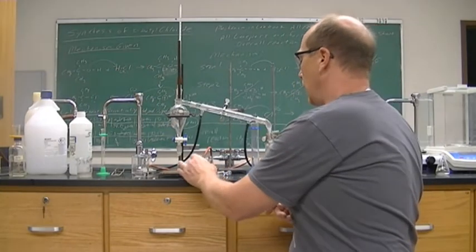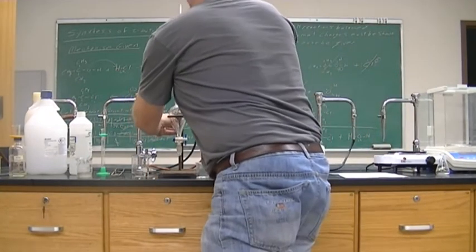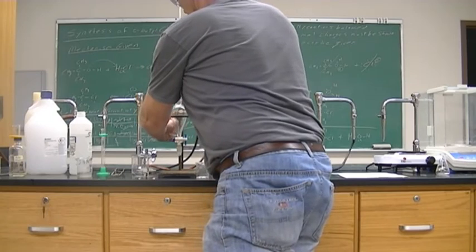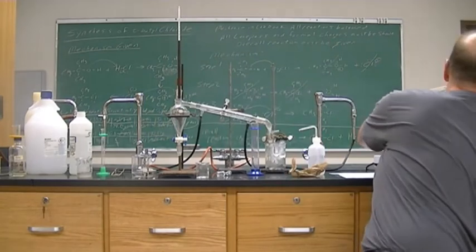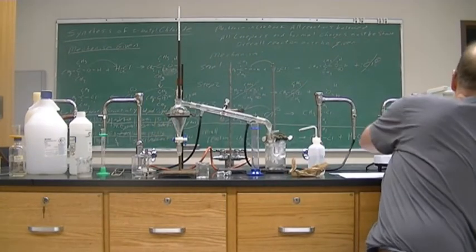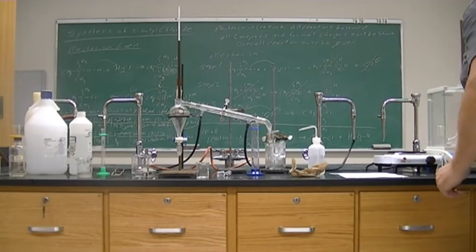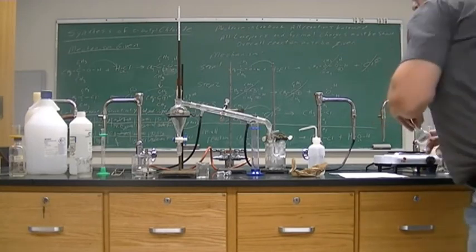All right, so now we're going to decant into our distilling flask. It's going to stay there. Before we start, I'm going to weigh it before and after.